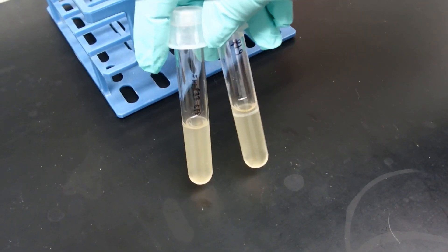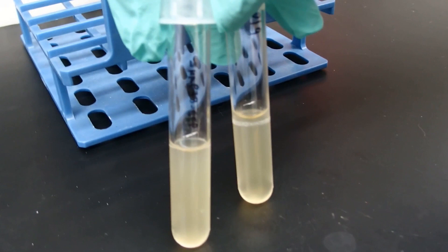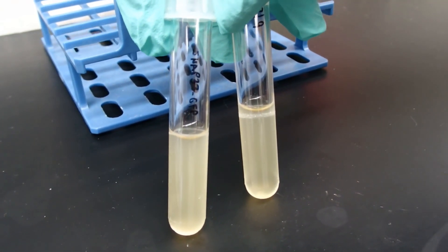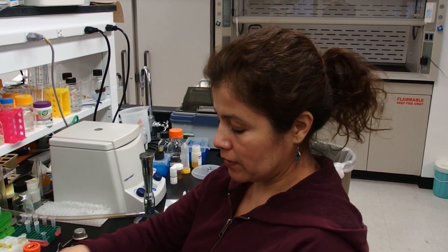The next day our bacteria have grown and we are going to check the OD600 in a spectrophotometer to calculate how much bacteria we are going to infiltrate in the tobacco plant. Please use the formula that is in the protocol on our website.